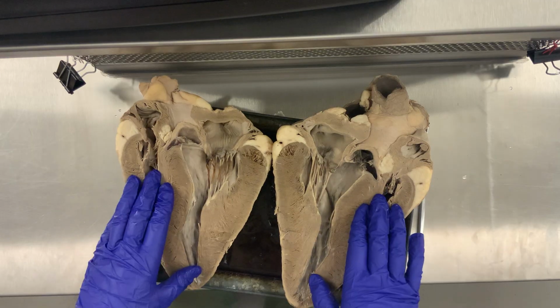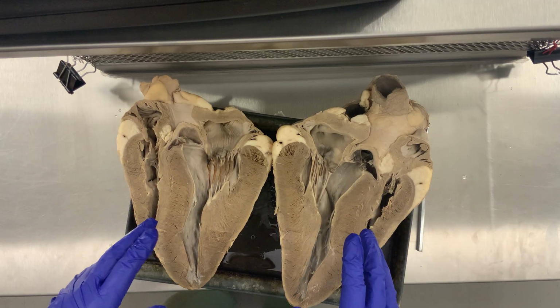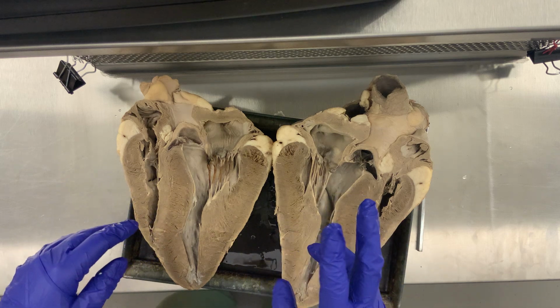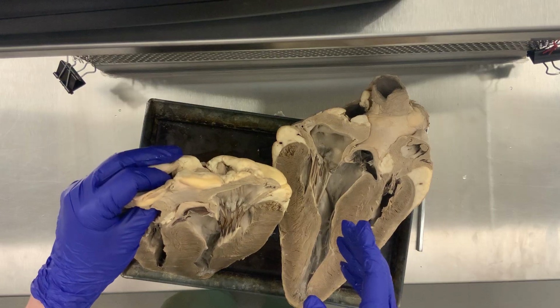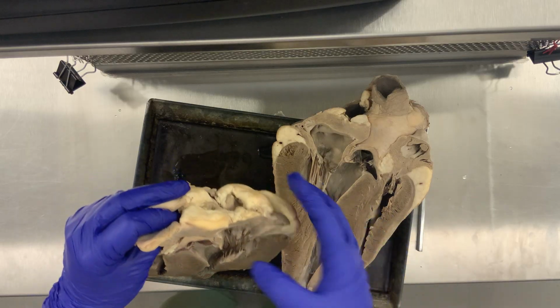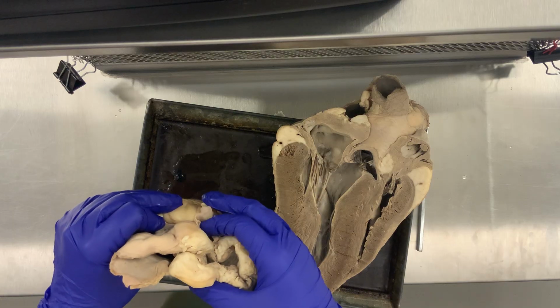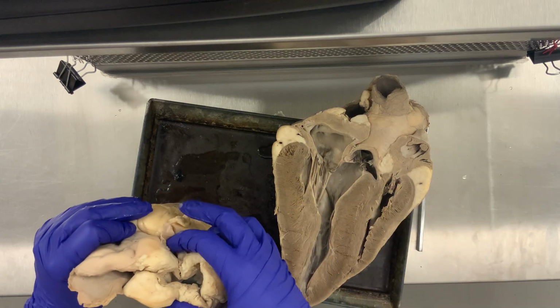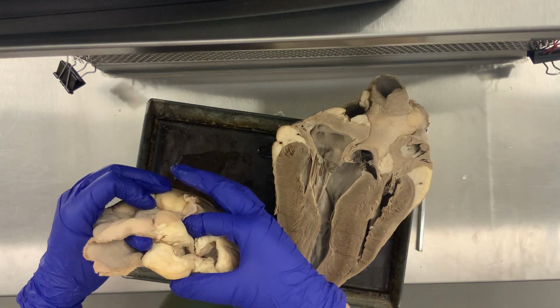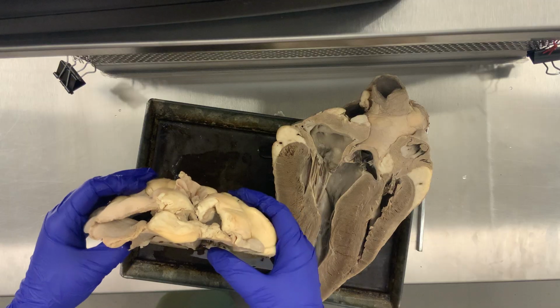To start with the blood flow, the place where the blood enters the heart is through the vena cava. There are two vena cava vessels in the heart. When you're working with animal hearts, just be aware that they're called the vena cava because of the different center of gravity in quadrupeds. Sometimes they're not going to be as conveniently placed as the superior and inferior vena cava on the human heart. Just know that there are two of them, and if you label them vena cava, you will get points. On the human hearts, be aware of which one is which though.